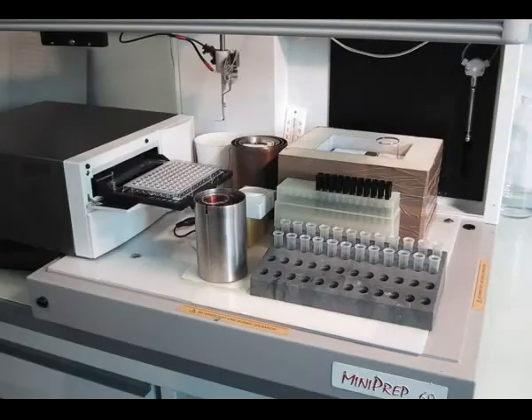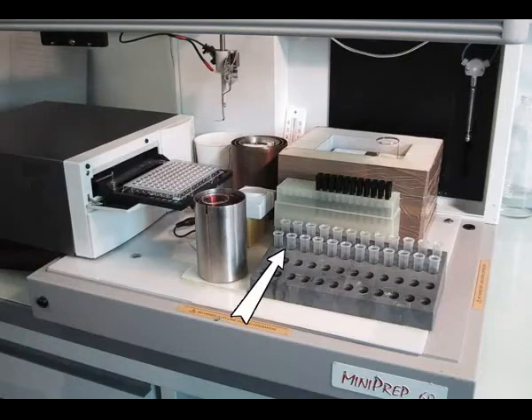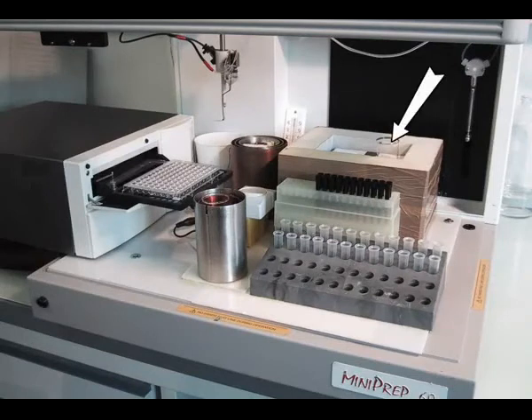On this view, you can see in the front the rack with empty tubes. Behind it, disposable tips that are black, and behind it, a nice box containing the plasma.